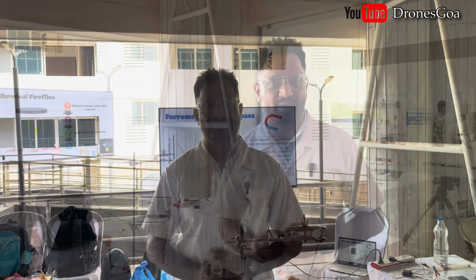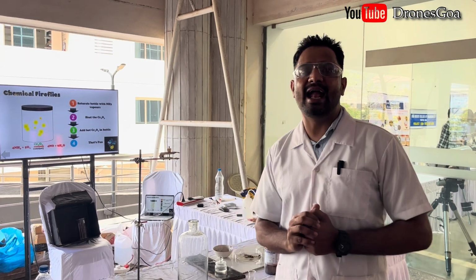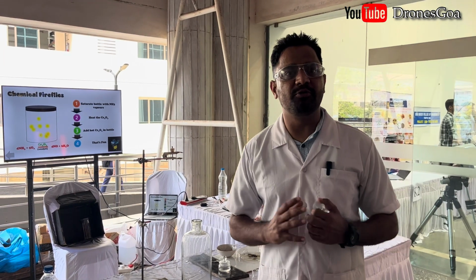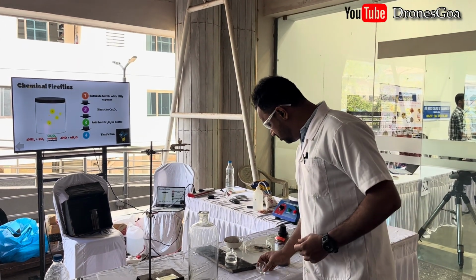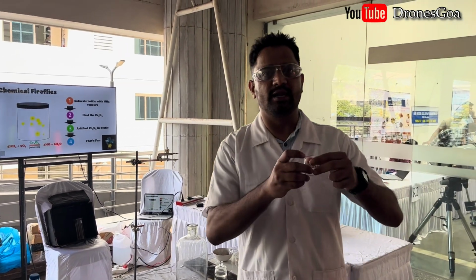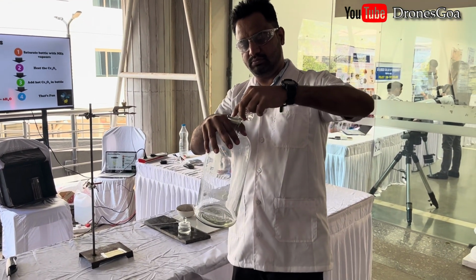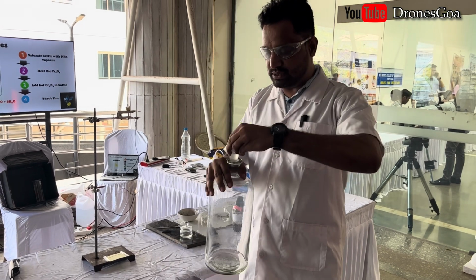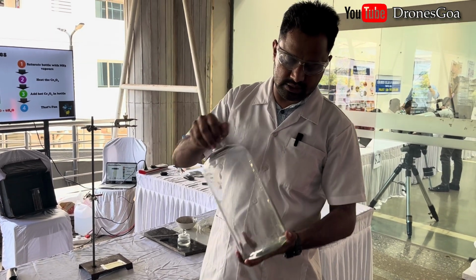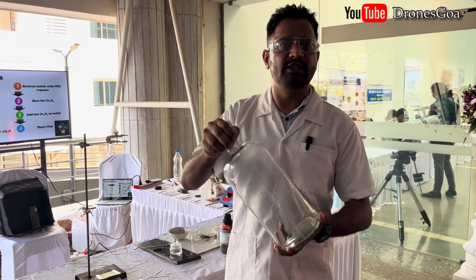We all love fireflies, right? Jugnus. And today we are going to see how we are going to prepare fireflies in the laboratory. For that, I have taken concentrated ammonia and I'll pour it in this bottle. Now I will shake this thoroughly so that my bottle is saturated with the vapors of ammonia.